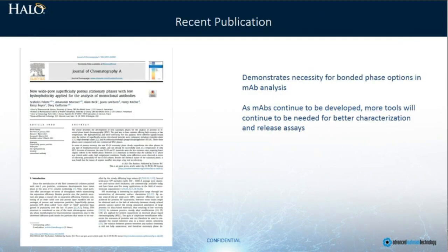Okay, so we've extended this recently with an additional bonded phase that we've just described in the literature. This uses a more polar bonded phase material, the trifluoroacetamidopropyl, a sterically protected material, and this has recently come out. If you would like a reprint or further pointer to that, please let us know. And with that, I'll summarize.